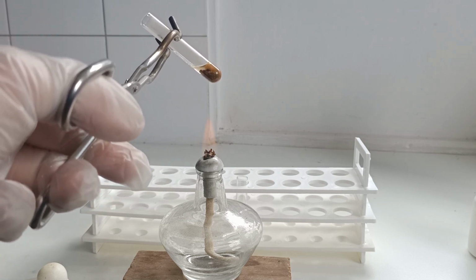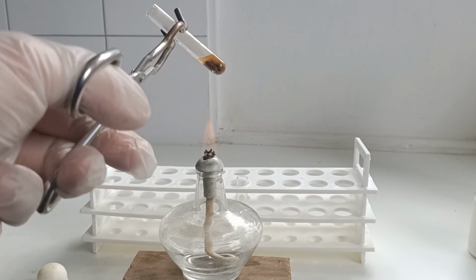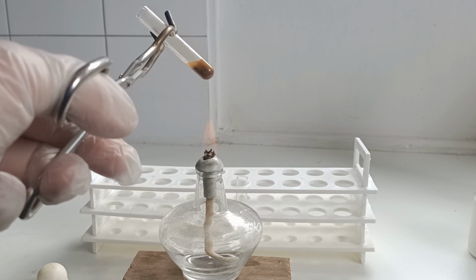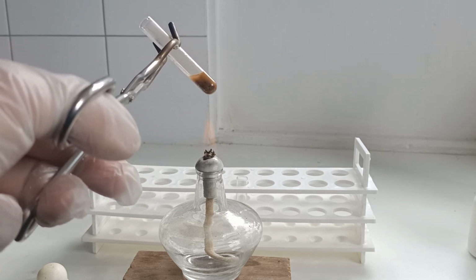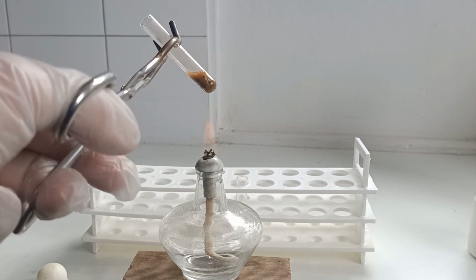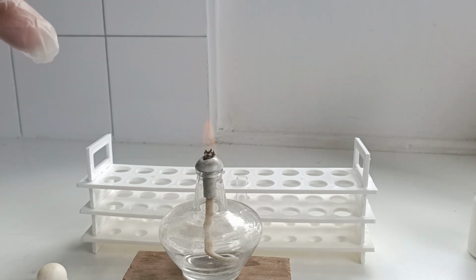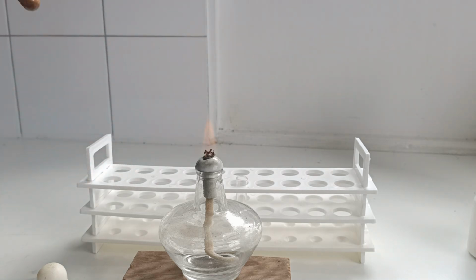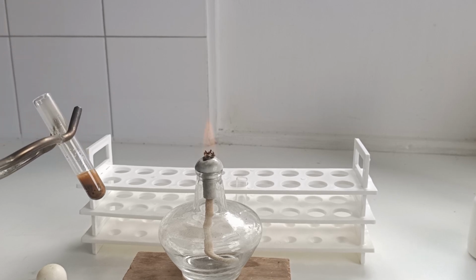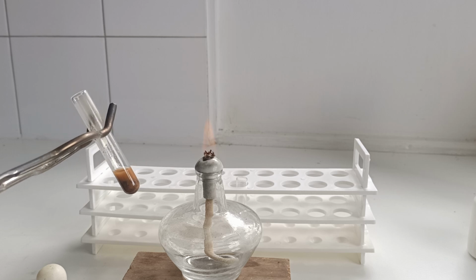Boil that gently and lightly, a little Bunsen burner, alcohol burner. Don't want to get a particular hot spot because I do not want that hot nitric acid all over my workshop bench for obvious reasons. It will really change your complexion for the worse, this stuff. That will do. Set that aside to cool off and settle, and then we'll add our ammonium molybdate solution to that.